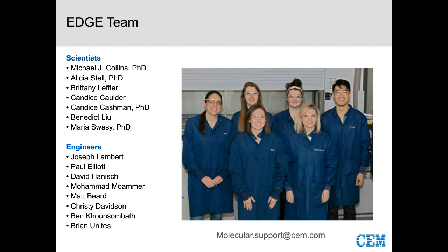If you didn't want to do that dilute step, you could pour it into a graduated cylinder and see what your volume is. You just need to know exactly what your volume is for quantitative analysis. And then in this case, we did neutralize with formic acid as well, and then we went direct to analysis. As far as the standards are concerned, we're adding surrogates at the very beginning, when we spike. But we also add an internal standard right before injection to make sure the analysis is good.